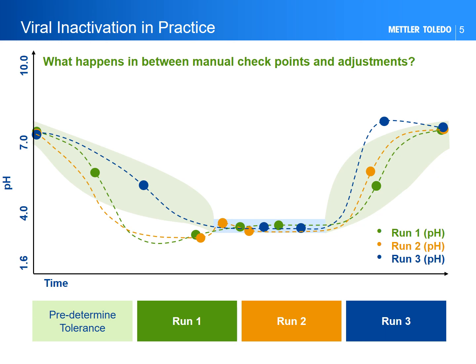These kinetic profiles, in addition to the data from intermittent sampling, are full of lost process insight and otherwise vital to truly understand a process. But it is also easy to overlook, especially with many legacy methods. When we have access to kinetics and ease of data overlay, we can begin to ask questions about what causes anomalies and understand the operation actions or process parameters which may come to influence them.